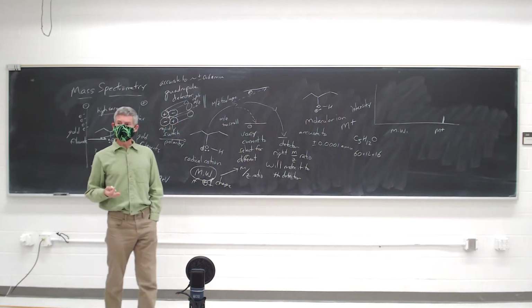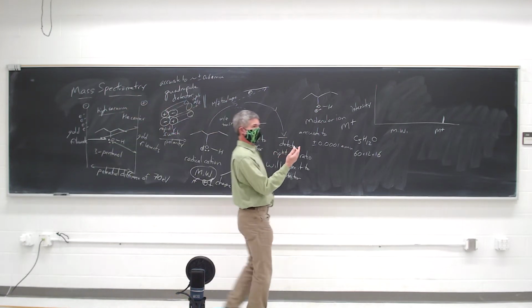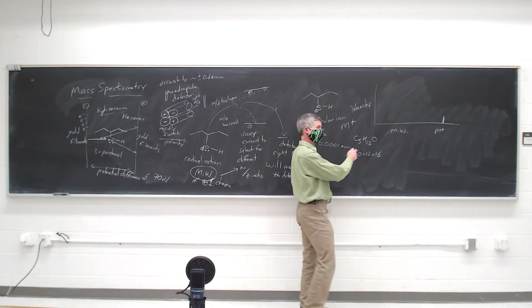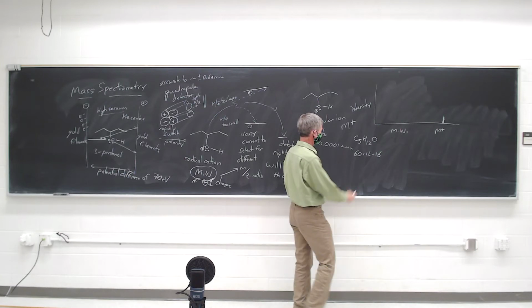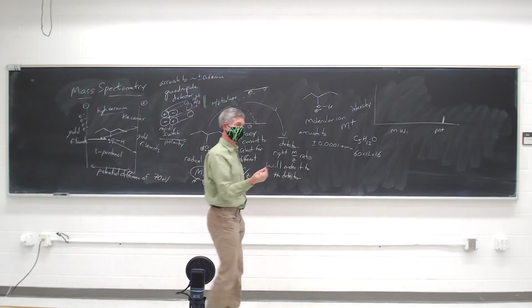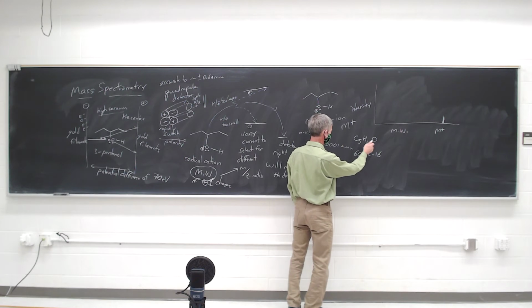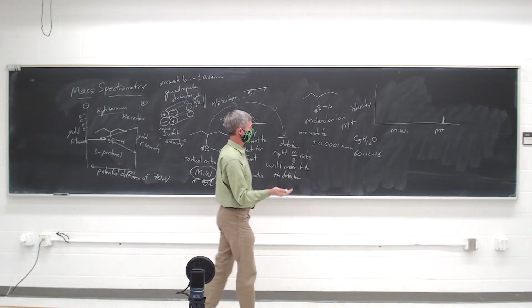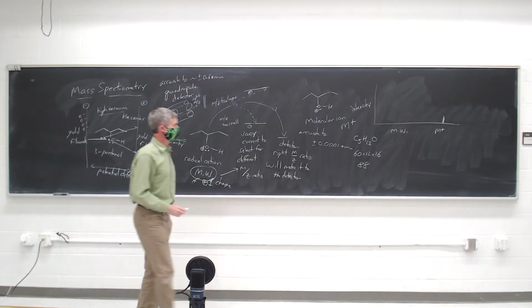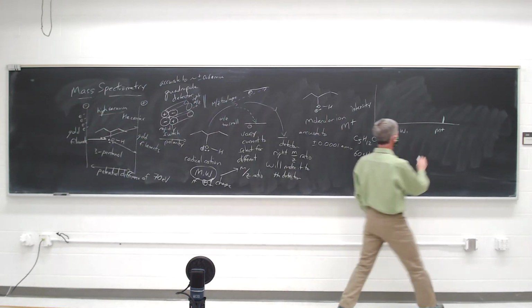And the important thing about mass spectrometry is you're actually seeing the individual molecule. So you're not seeing the weighted average atomic mass. You're actually seeing carbon 12, which is 12.000 atomic mass units. And you're seeing the proton, the hydrogen plus. And you're seeing oxygen 16, not oxygen 17 and 18. So it's good enough to just use 12 for carbon and 1 for hydrogen and 16 for oxygen. You don't need any decimal places. So that's 88, right? So we're going to see a peak at M plus at 88 atomic mass units.